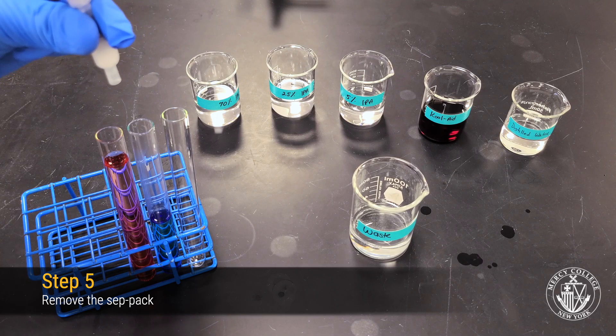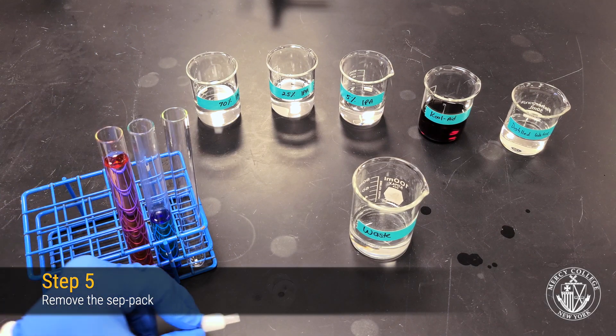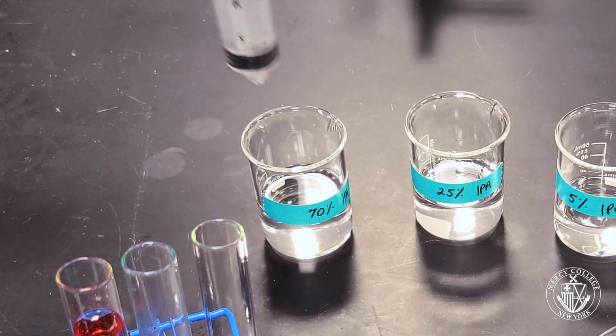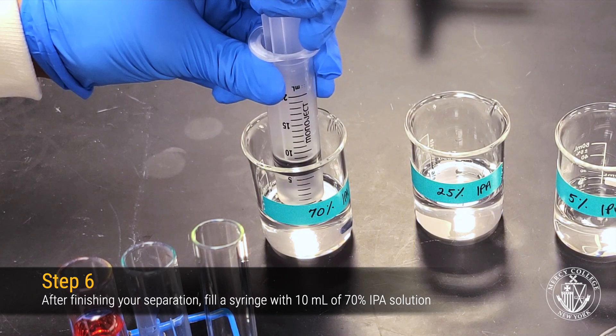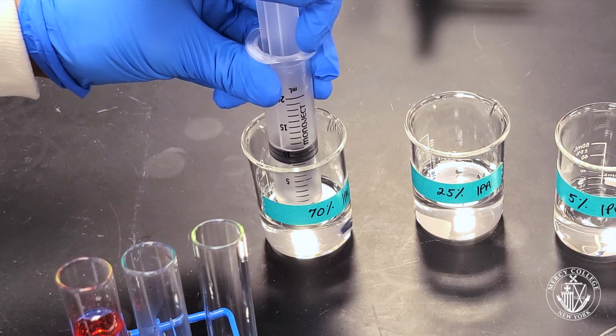After you've completed the separation, remove the CEPPAC cartridge from your syringe and refill your syringe with 10 mL of 70% isopropyl alcohol. This solution will be used for cleaning our column before storage.